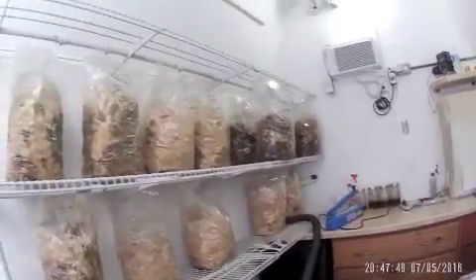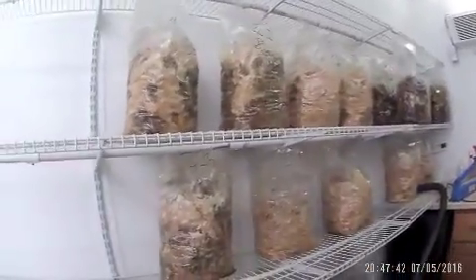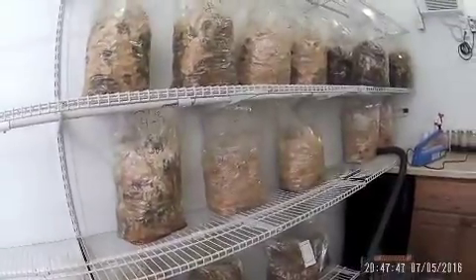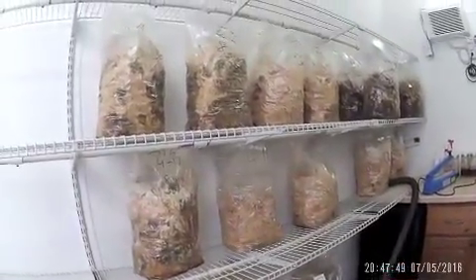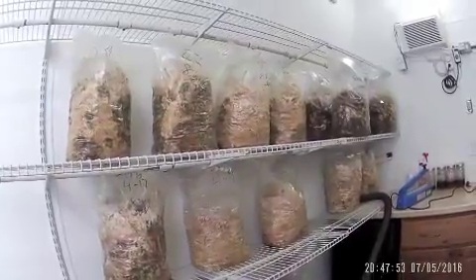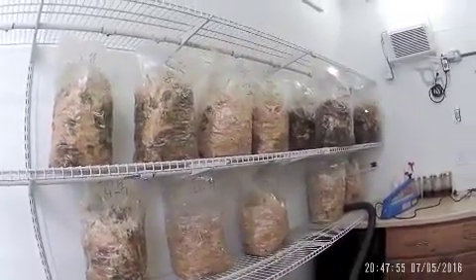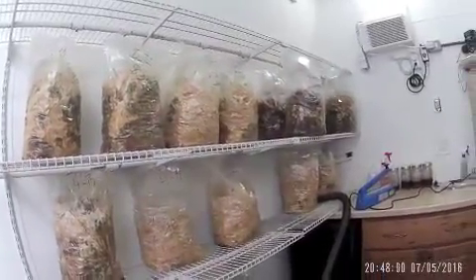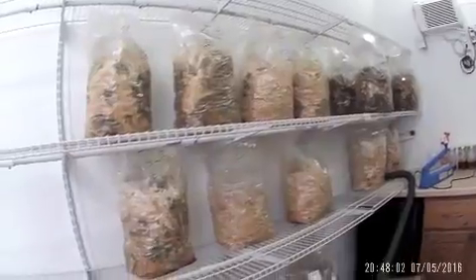I've got some experiments I'm trying over here with straw. I've had some problems with straw lately — it tends to get a lot of green mold, especially when I use the cold pasteurization method. I've got a few that are doing all right, but the majority of them aren't.